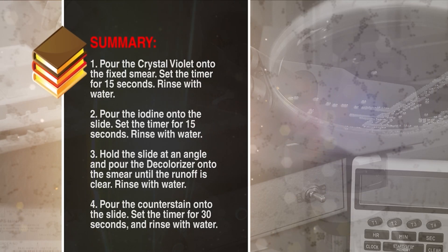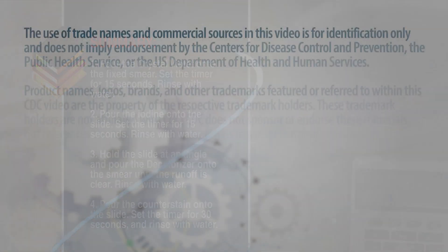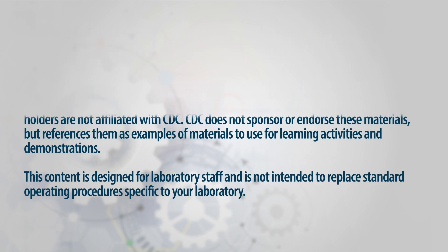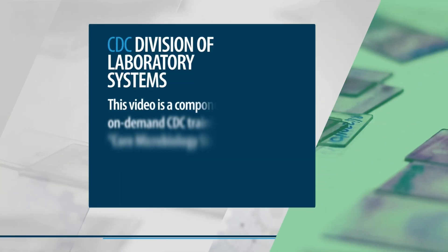To summarize the steps for the gram stain: pour the crystal violet onto the fixed smear and set the timer for 15 seconds, then rinse with water. Pour the iodine onto the slide, set the timer for 15 seconds, and rinse with water. Hold the slide at an angle and pour the decolorizer onto the smear until the runoff is clear, then rinse with water. Pour the counterstain onto the slide, set the timer for 30 seconds, and rinse with water.